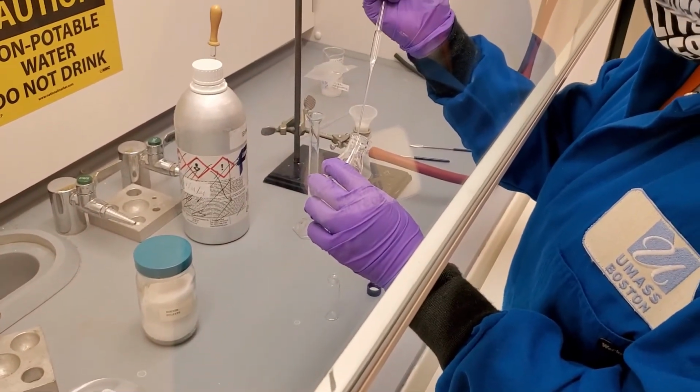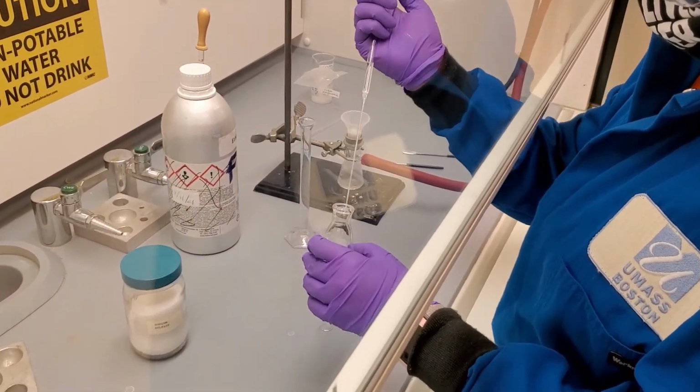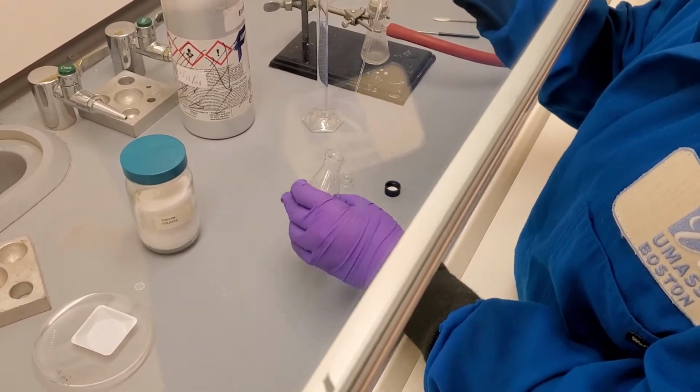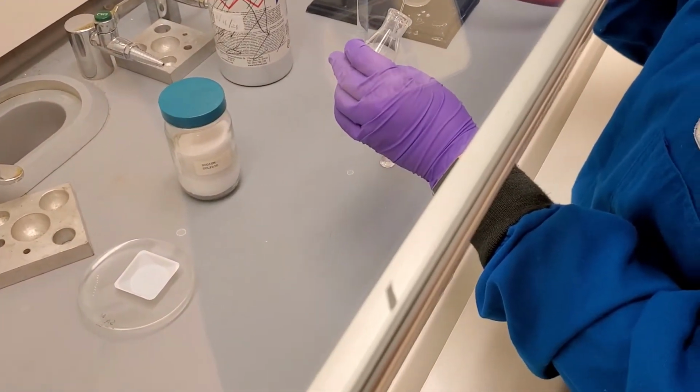Using a Pasteur pipette, transfer the ether solution to the weighed product vial. Make sure not to suck up any of the sodium sulfate crystals.